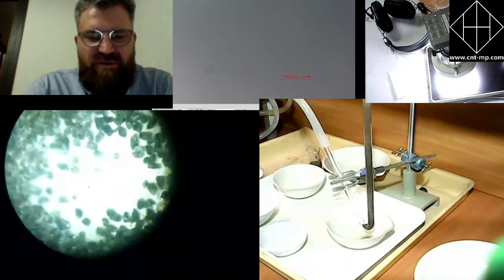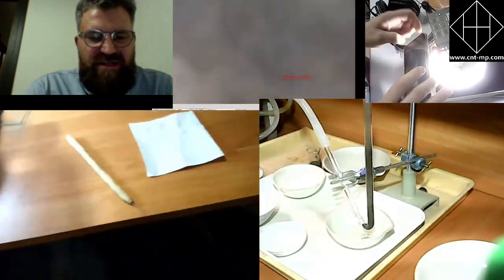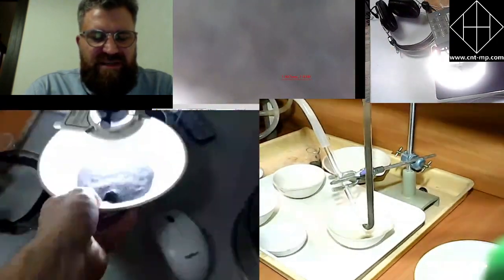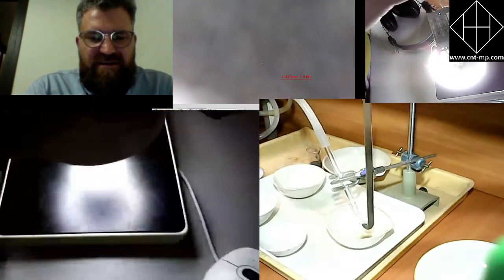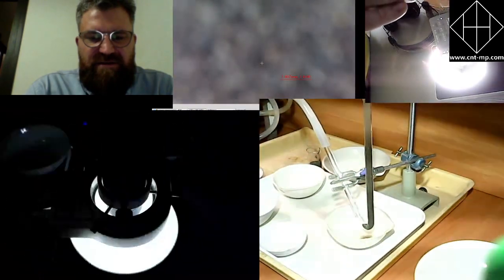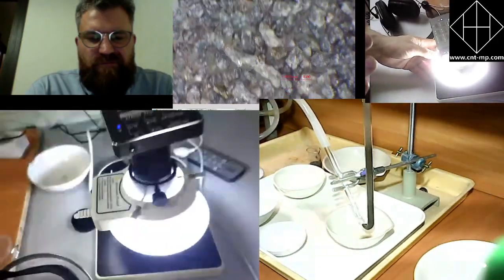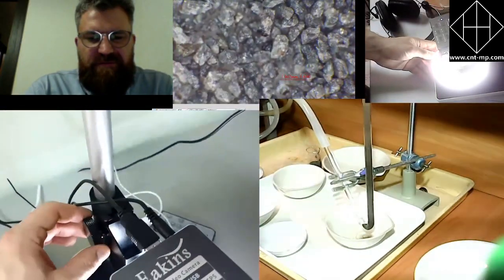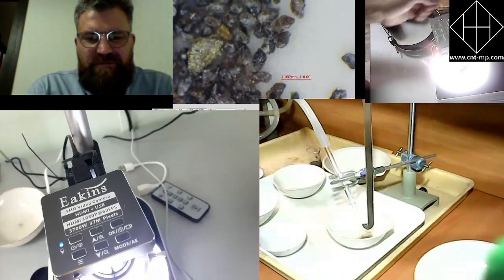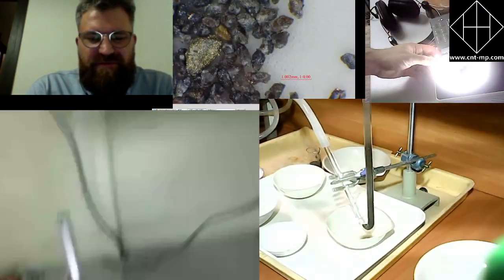But he will just be showing you, I think, he will make a circle around a specific grain to show you guys that this is sulfide. You can hardly see it. Alek, is there a way to see it under the camera? So he found the sulfide grain that he wants to show you, I guess.